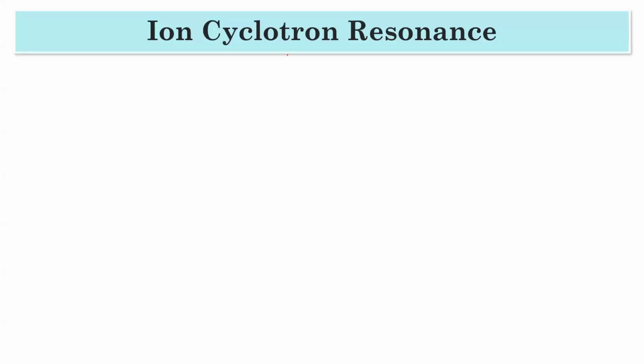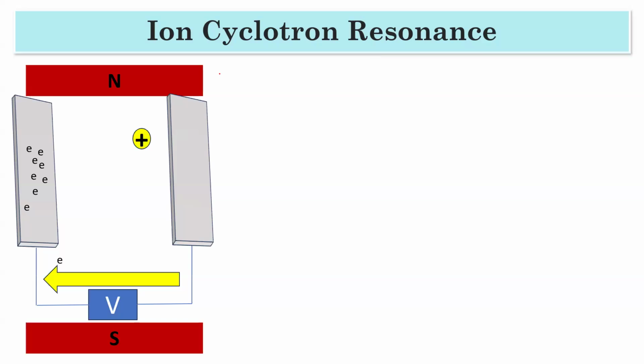Okay, this is very important, so please try to focus here. This is ion cyclotron resonance, also called ICR. Here I just want to give you an example. Suppose you have some charged particle.